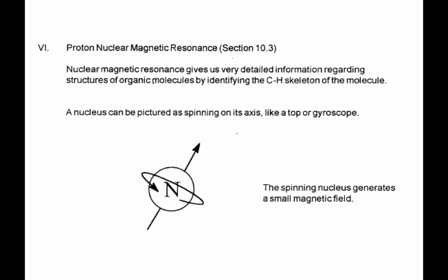This gives us very detailed information because I'm going to look at the carbon and hydrogen structure and skeleton with proton NMR.